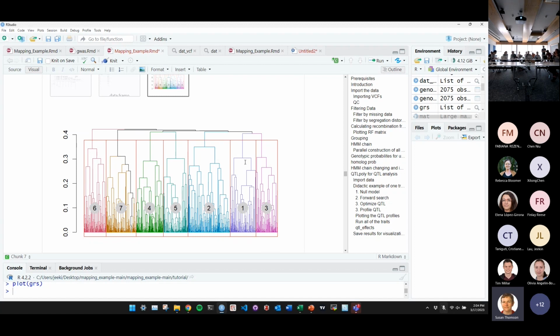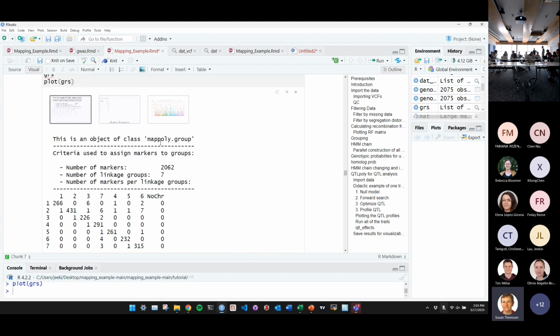Those are your 7 linkage groups. We just trust the rose genome, so we cluster by the genome order. You often encounter, if you actually check, occasional linkage across chromosomes. We do have that in our diploids. We've seen some pseudo linkages sometimes, and we don't know why. It's probably statistical: small population size, a lot of markers, some of them look like they're linked. And then you just go in and say, this is the linkage group. Yeah, there's 7 linkage groups.